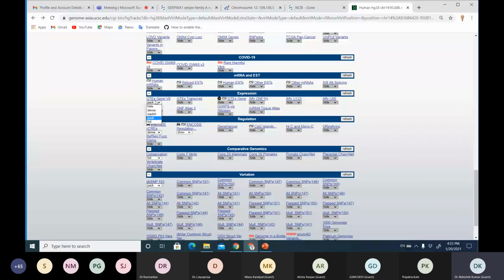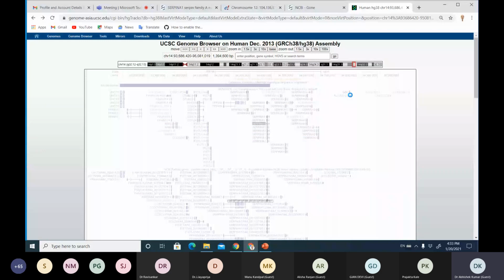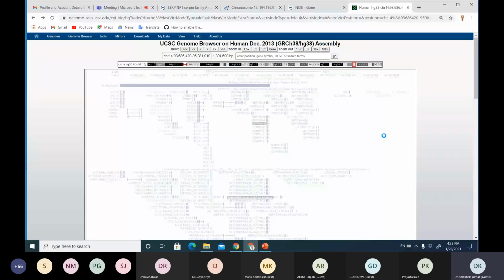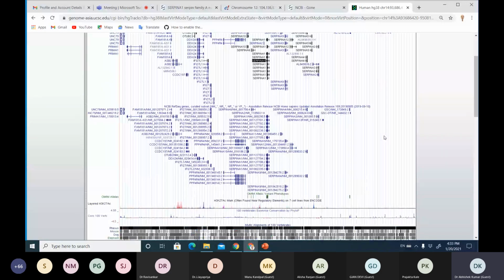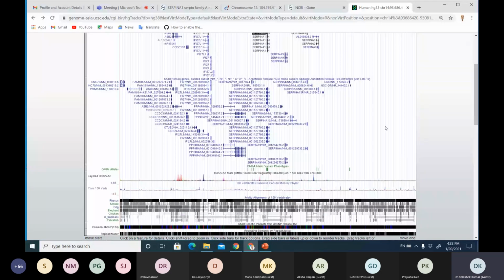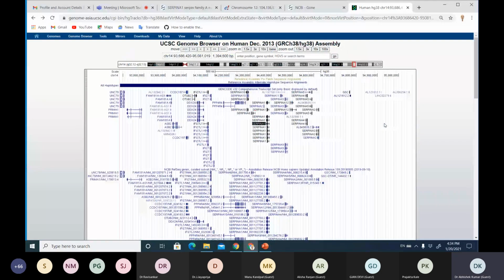So one can change what you want to look at. So the earlier bars are missing now. So this is hidden. Suppose this ENCODE non-coding data is also available. If I go here to ENCODE, I can just hide it. This one also I can hide, and I just refresh it. It will be gone. So it can actually show a lot of information for the genomic region, and now it's hidden. So one can hide and play on and off.